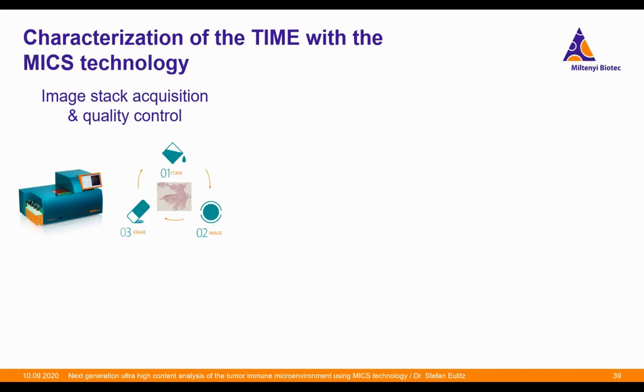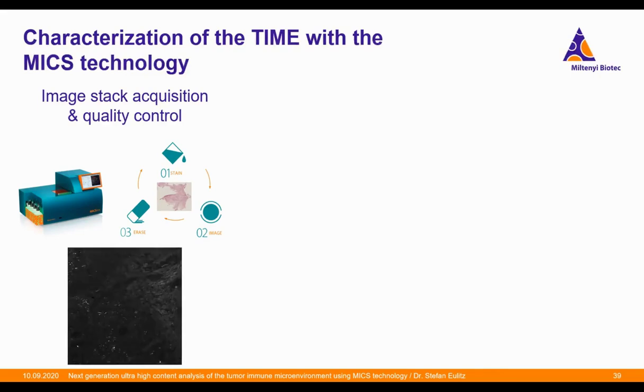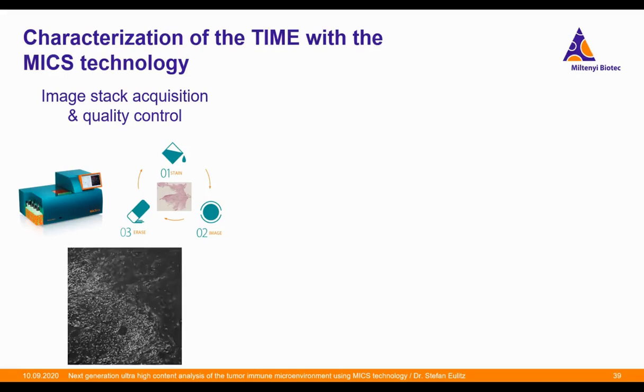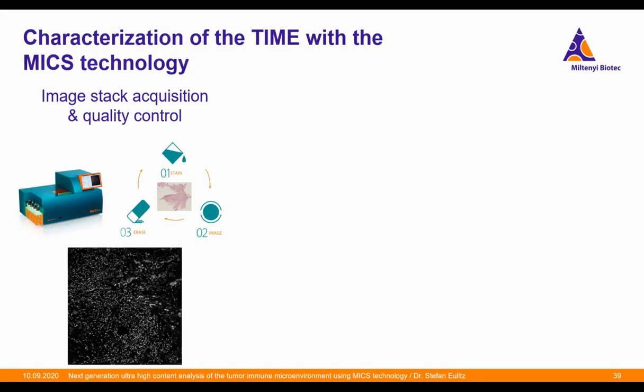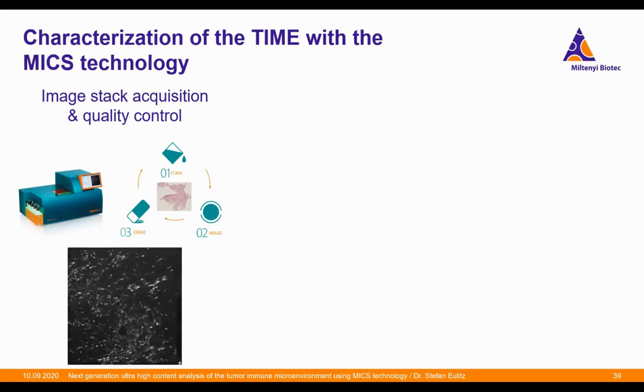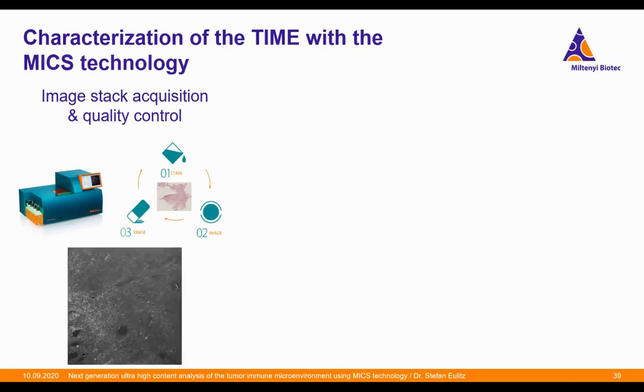So everything would start with the data acquisition done by the MACSima instrument. And this is then, of course, done in the cyclic staining process. And then you would obtain an image stack of the markers you have used. Especially in the beginning of a project, you would most probably start with 100 or even more markers in order to start the project as unbiased as possible, as any non-stained marker would be a self-chosen limitation. Since the MACSima can image hundreds of markers, there is no technological limit existing.